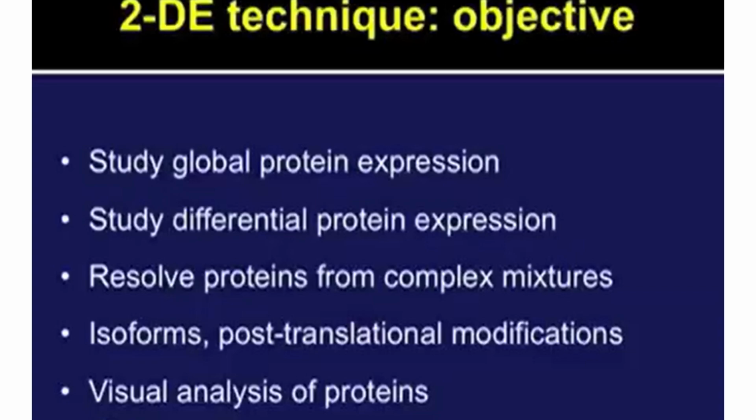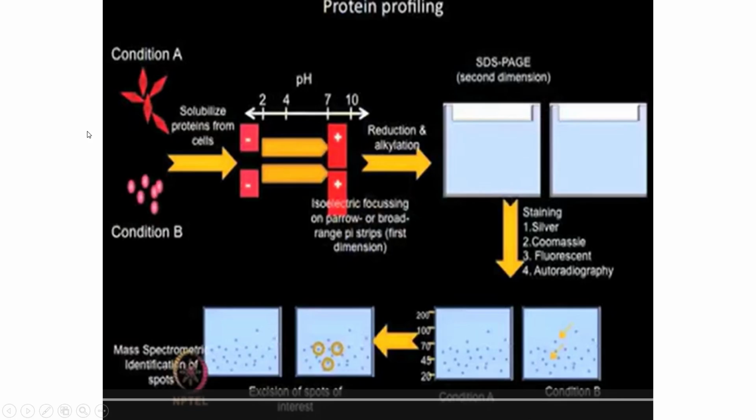It will help you to study differential protein expression. It will help you for resolving proteins from a complex mixture as well as isoforms. All those can be done. So this is just an overview of each and everything.